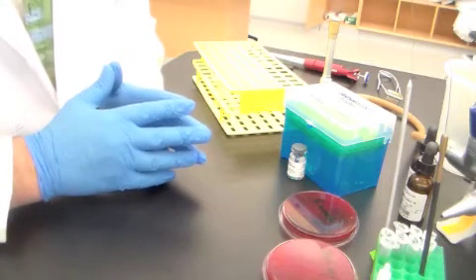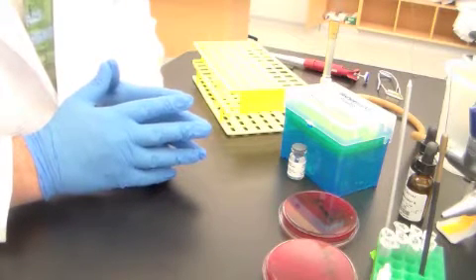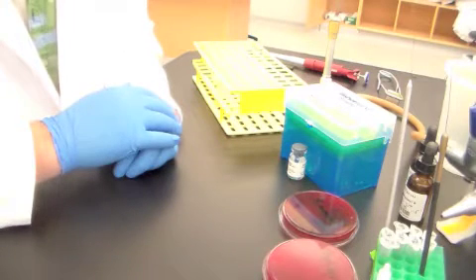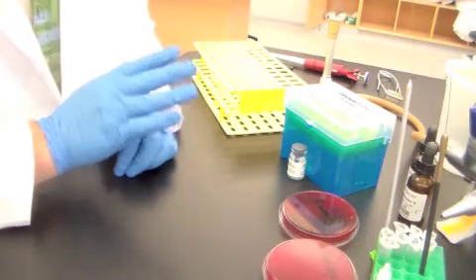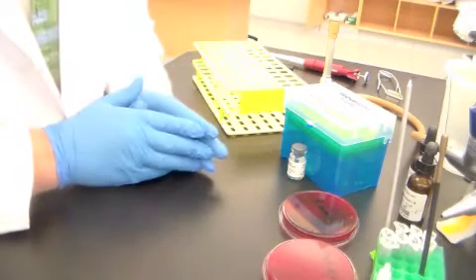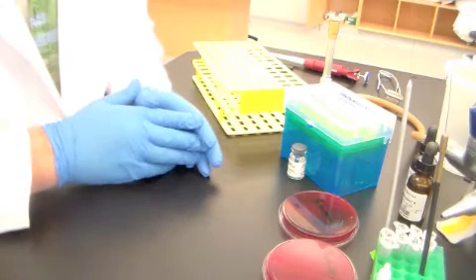The next part of the video is going to be talking about tests that we did last week and some more inoculations for this week. So this is the end of this section of the video, but I'm going to knit this together with a video that I already did yesterday covering the rest of the tests.